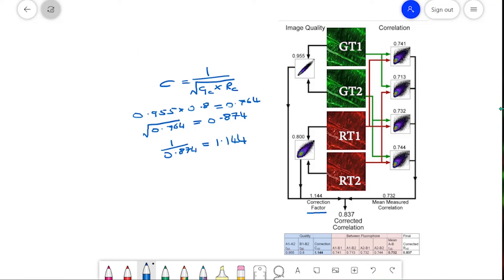What we then do is take the Pearson's correlation for green time one against red time one, green time one against red time two, green time two against red time one, and green time two against red time two. This gives us four individual correlations. We take the average of those correlations — in this case 0.732 — and multiply by the correction factor to get our corrected correlation of 0.837. This co-localization correlation factor takes account of the noise in the images. So if you've got noisy images, I would recommend you have a look at this technique.